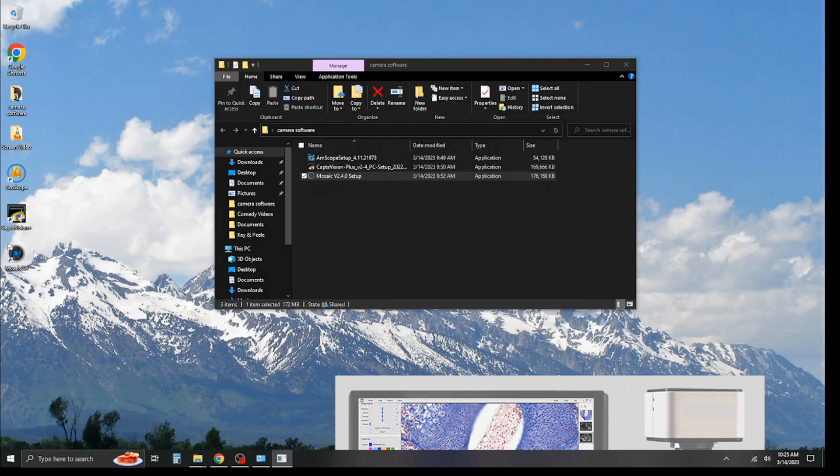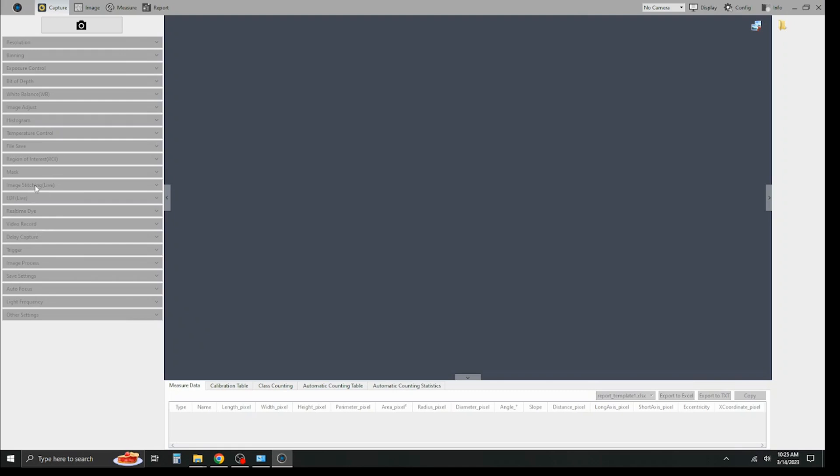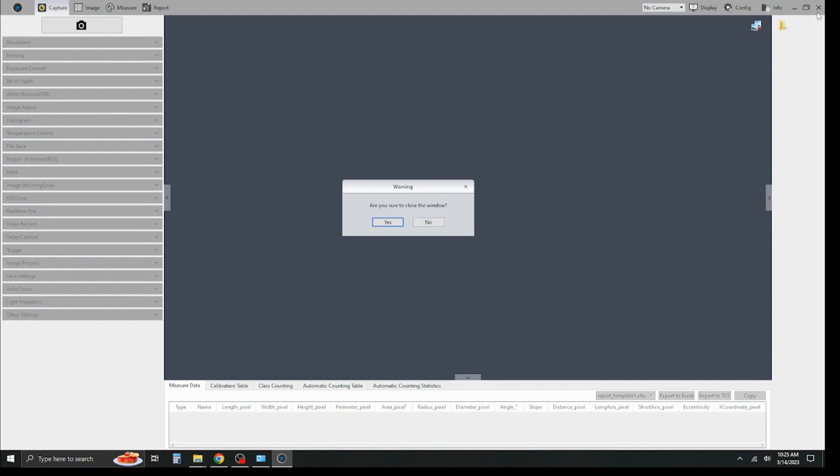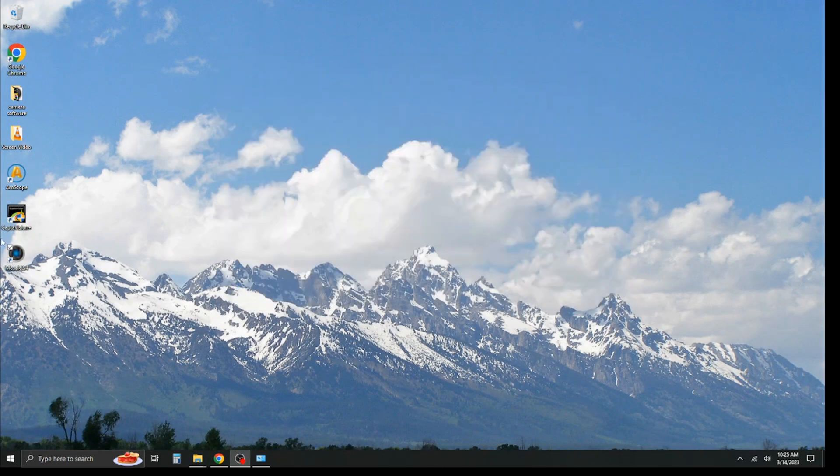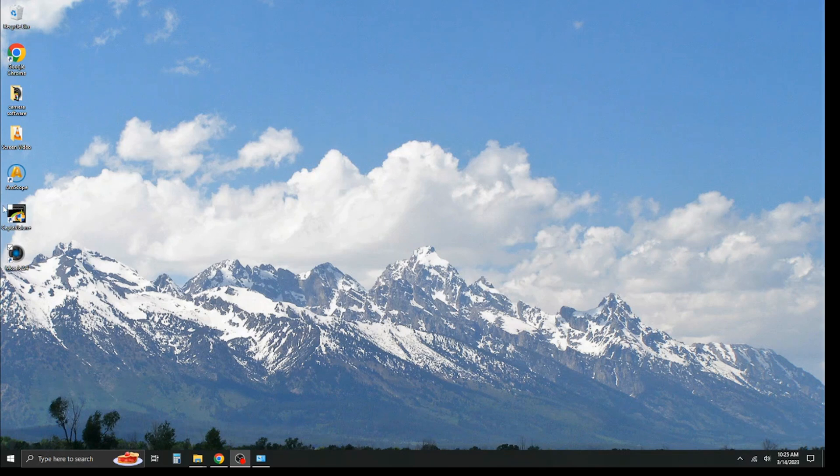Now, the keen eye among you may notice that this is very similar in appearance to the CapDivision Plus software. And that is because they, in fact, are produced by the same manufacturer and just re-skinned for the two different companies. So, in terms of usage and function and everything like that, the softwares are both very similar. All right. We're going to go ahead and close this out and close that up. And as you can see, we've installed all of our software.